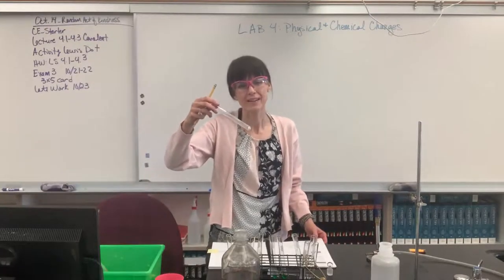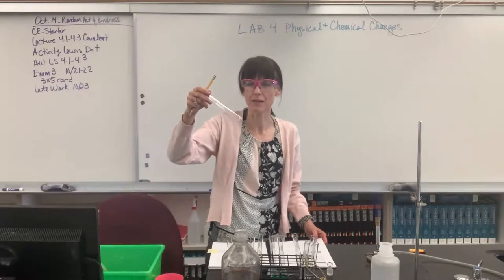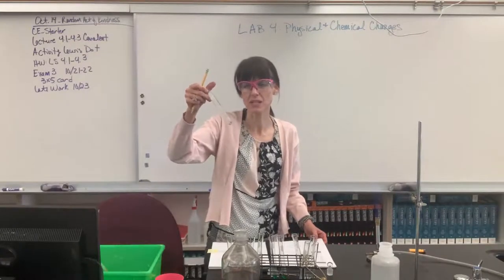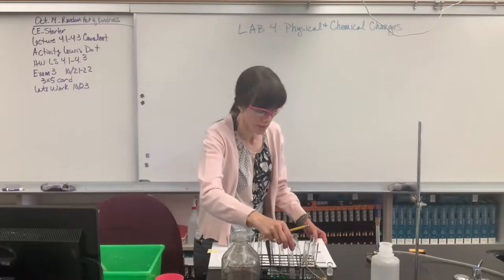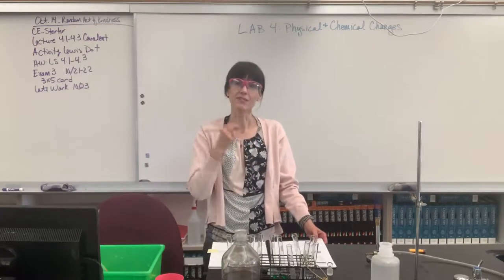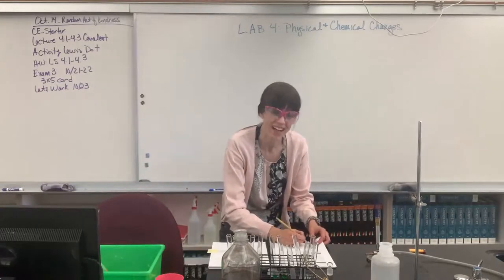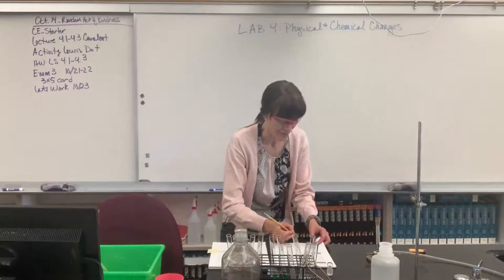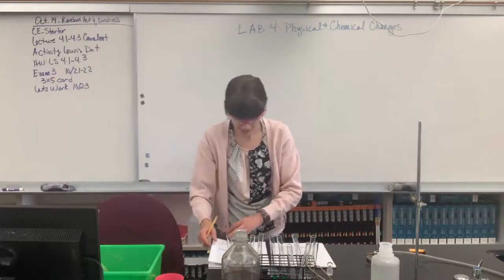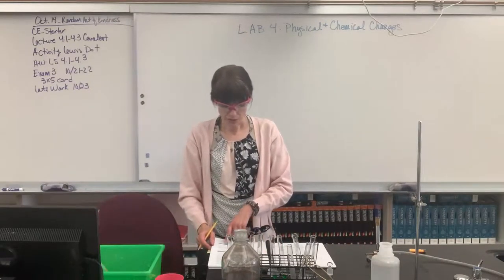Now I only added a handful of drops so it didn't consume all of the metal. If I had added a lot, it would have consumed all of it. But there's still metal left in here. So let's put down result of adding HCl that it evolved gas. So there was definitely a chemical reaction and that it produced a new substance. It produced a gas.